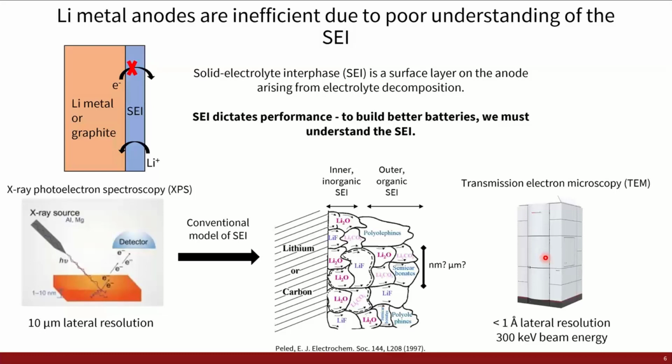Yeah. Okay, thank you. This one is the last one. Have you tried using direct electron detectors like K2 and K3 and dose fractionation for imaging lithium battery materials? Yeah, that's a great question, and I hinted at that earlier. Direct electron detectors, such as the K2 and K3 by Gatan, along with other offerings from other companies, are going to be very important for the low-dose characterization of the battery material and its SEI.